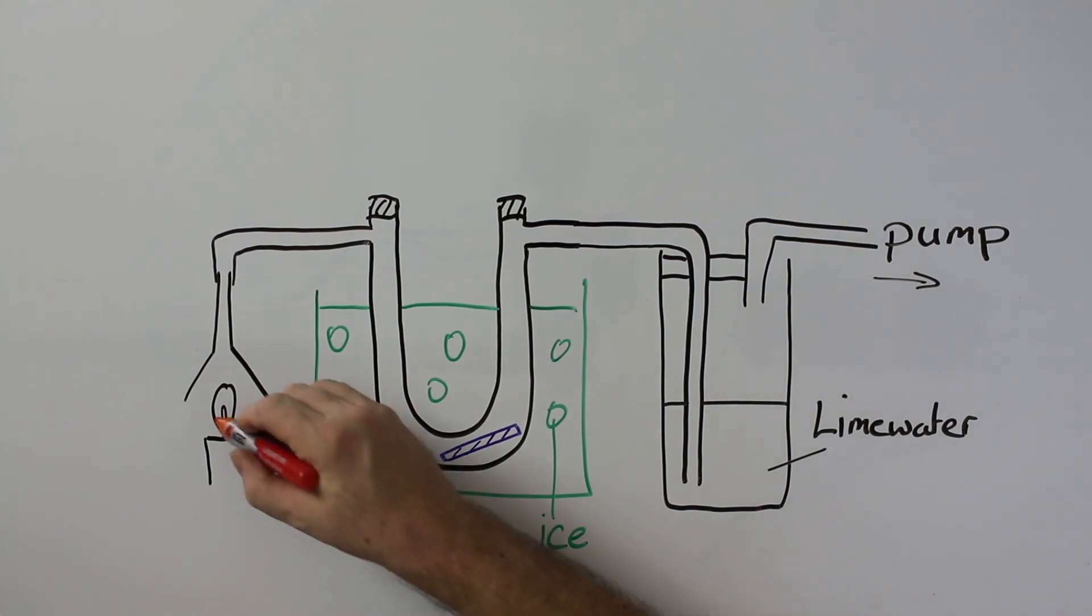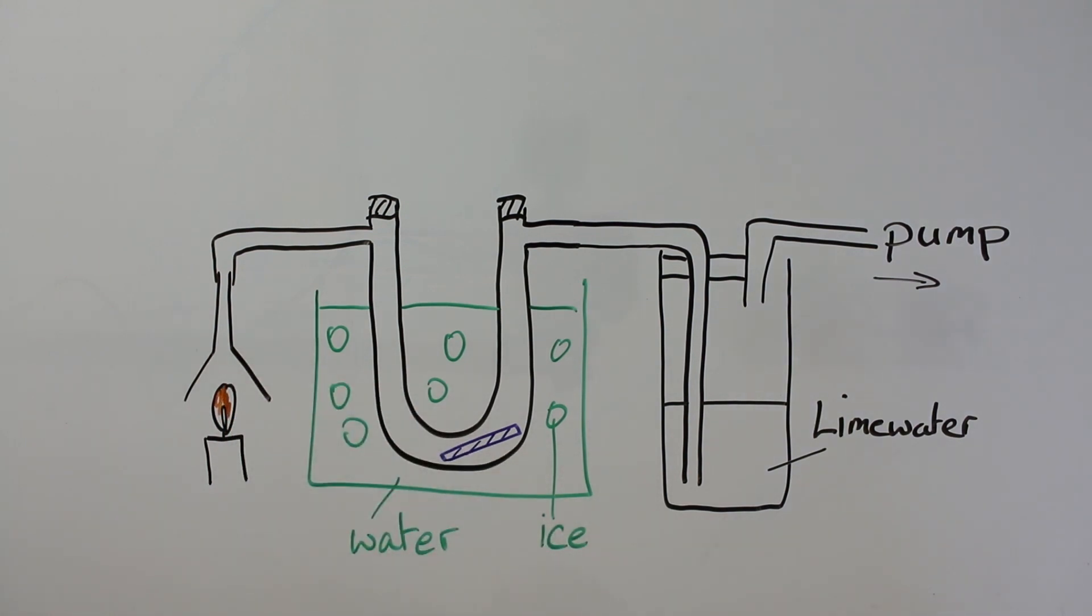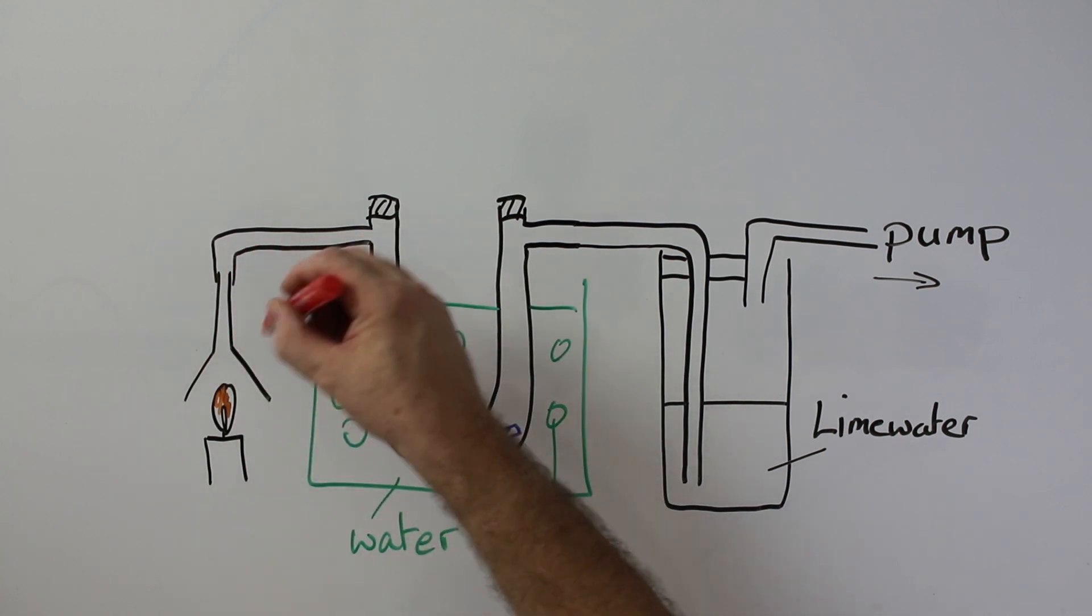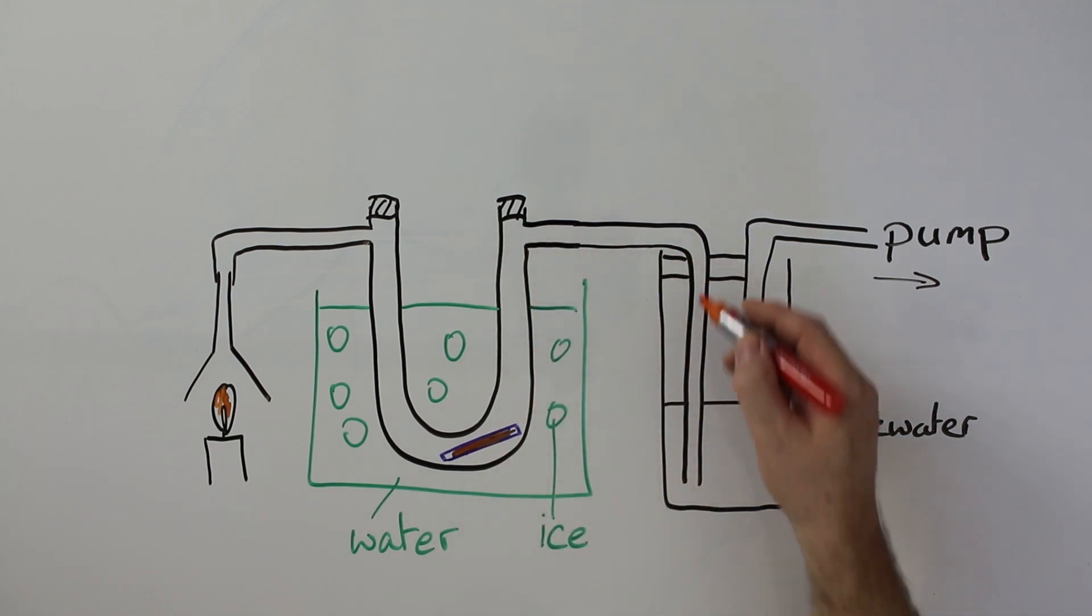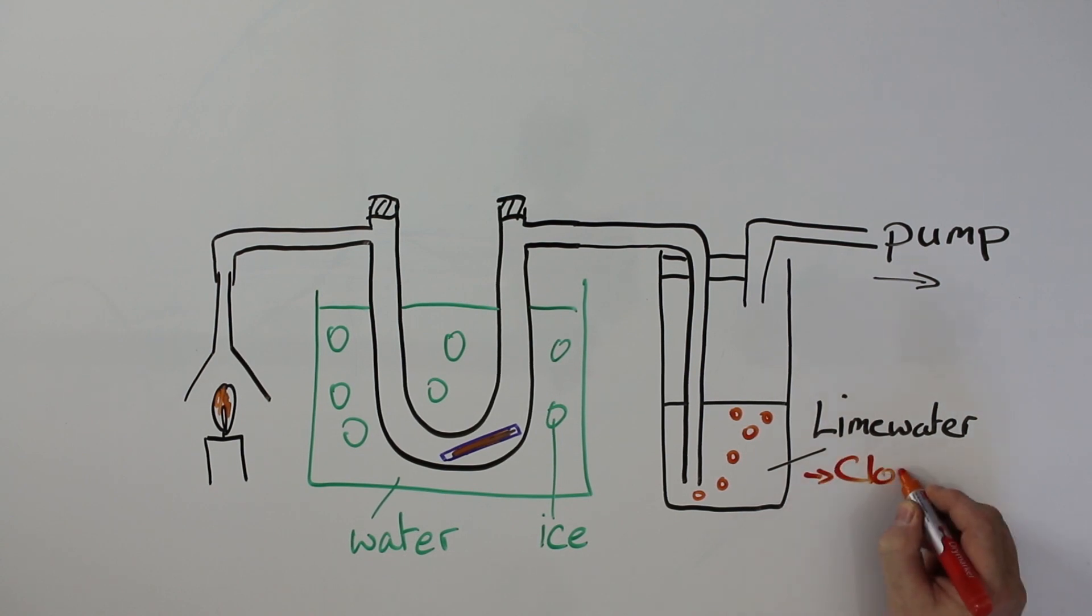The flame burns producing water and carbon dioxide. This mixture goes up through the tube because it's sucked up and in here the water condenses turning the cobalt chloride paper pink. And as the bubbles go through, then the lime water turns cloudy.